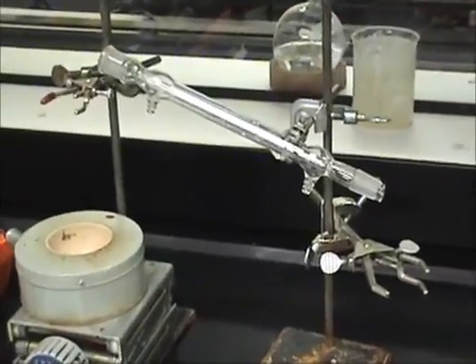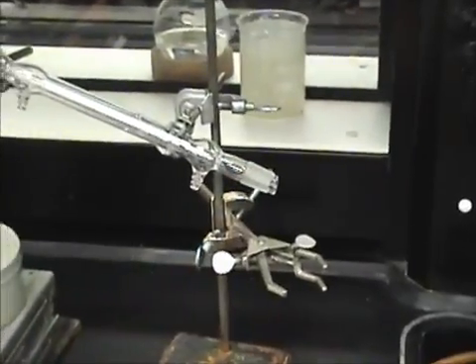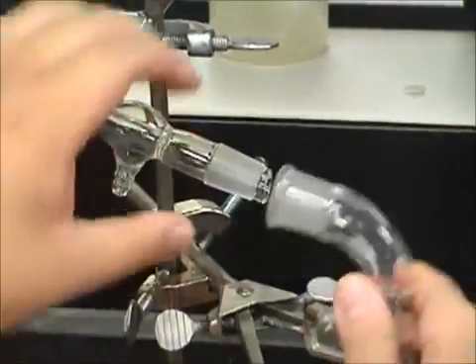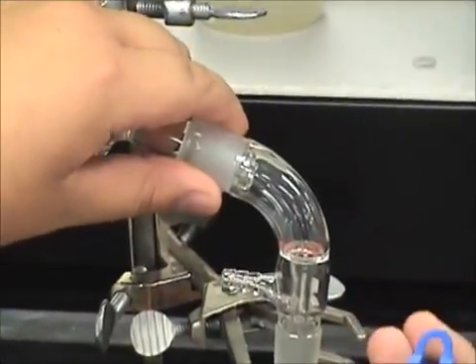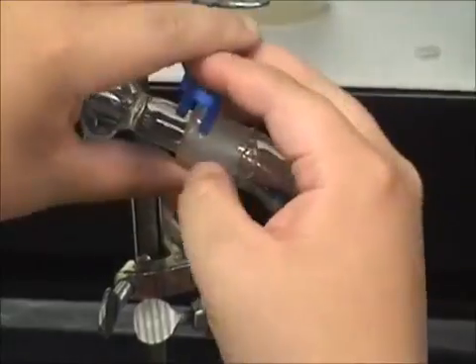Now, we can add the vacuum adapter to the skinny end of the condenser tube. Place a clip to secure the joint. Big side of the clip on the adapter, small side on the condenser tube.